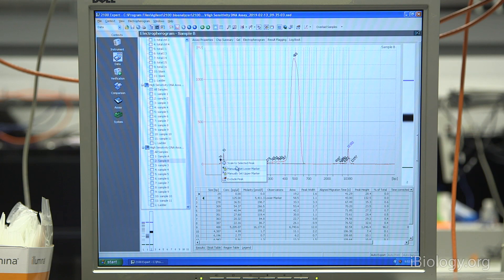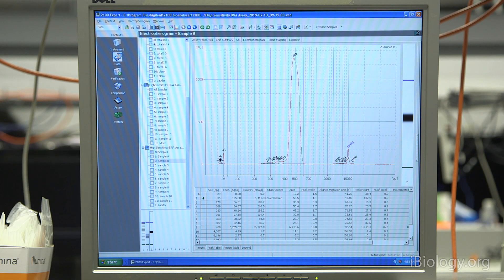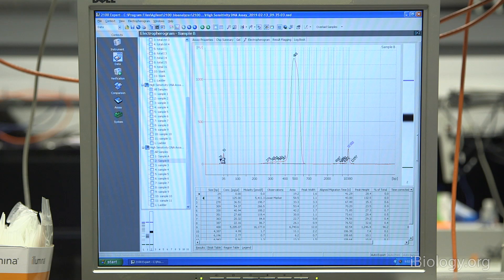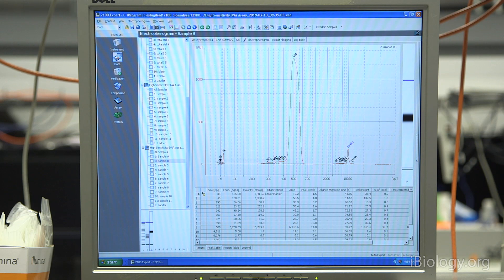For instance, if I wanted to call this 29 base pair peak my 35 base pair standard or internal reference, I can right-click on it and manually set the lower marker. This will recalculate the size of everything. Now you can see that the software has now called this my 35 base pair peak. And it's calling this marker a 46 base pair peak. This isn't what I actually want, so I'll go ahead and change it back and hover over my actual lower marker, see the bullseye, right-click, and set lower marker.